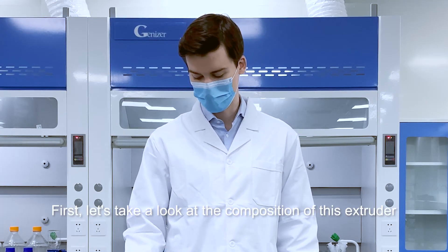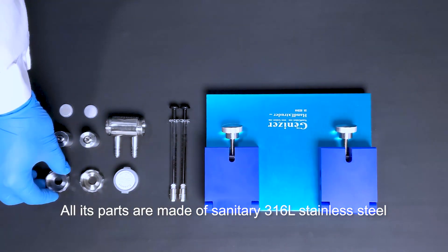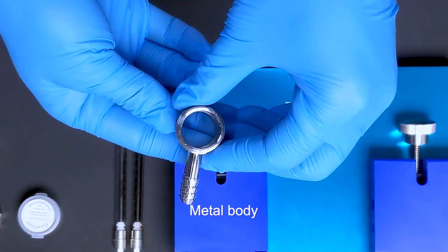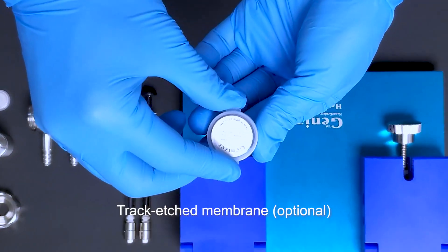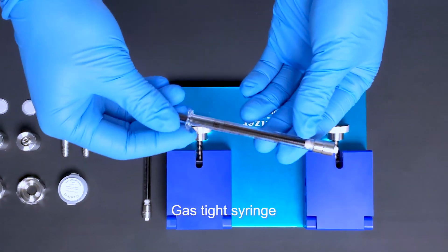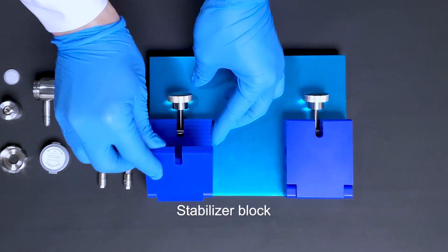First, let's take a look at the composition of this extruder. This is the filter chamber. All its parts are made of sanitary 316 stainless steel: screw cap, metal body, track etched membrane, gas tight syringe, and stabilizer block.